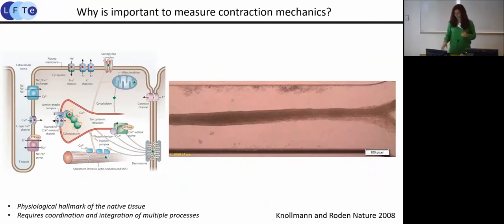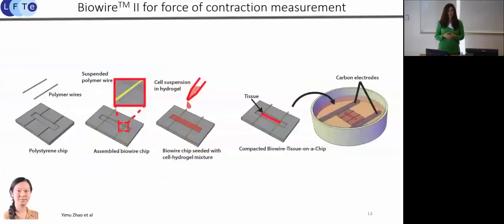And this is this excitation-contraction coupling cascade. So what my student Yimu did is then she re-engineered the BioWire platform. She made like the second generation of BioWire platform, where we got rid of PDMS. This well is now made completely out of plastic.